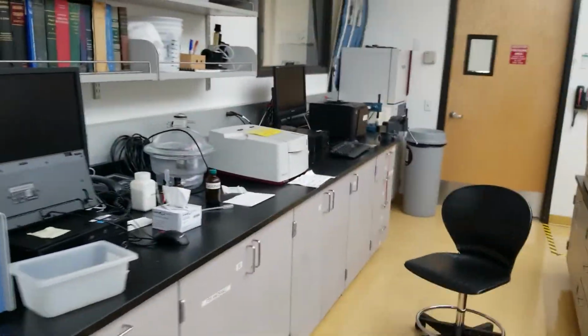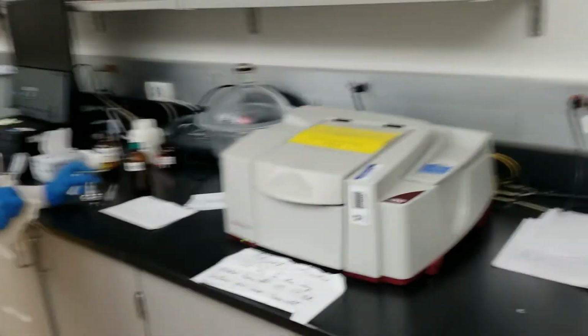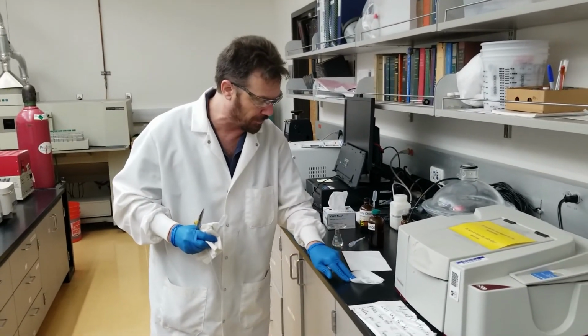All right. I haven't shown this in a video yet, so let's show them what it looks like. It's in the room over. This is our instrument room here. It looks familiar. All right, we'll put our sample here. And Professor Ormord has us set up here with a couple of salt plates ready to go.